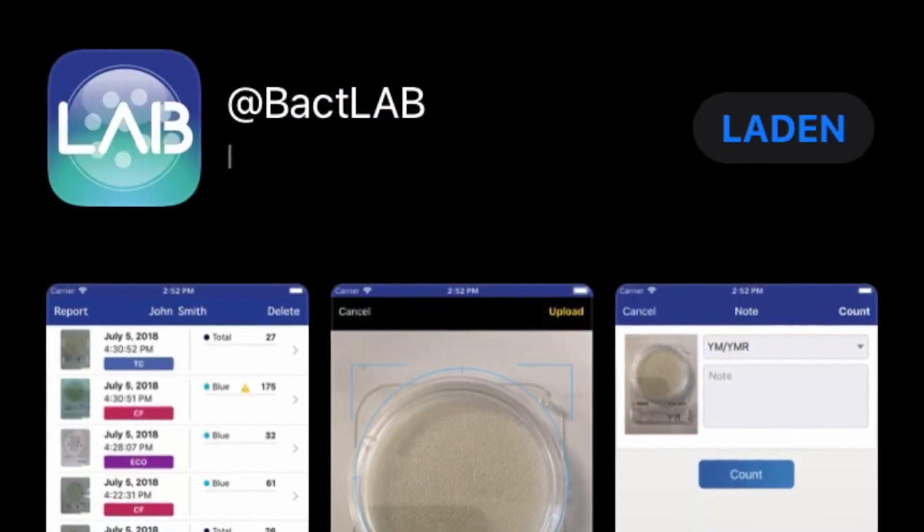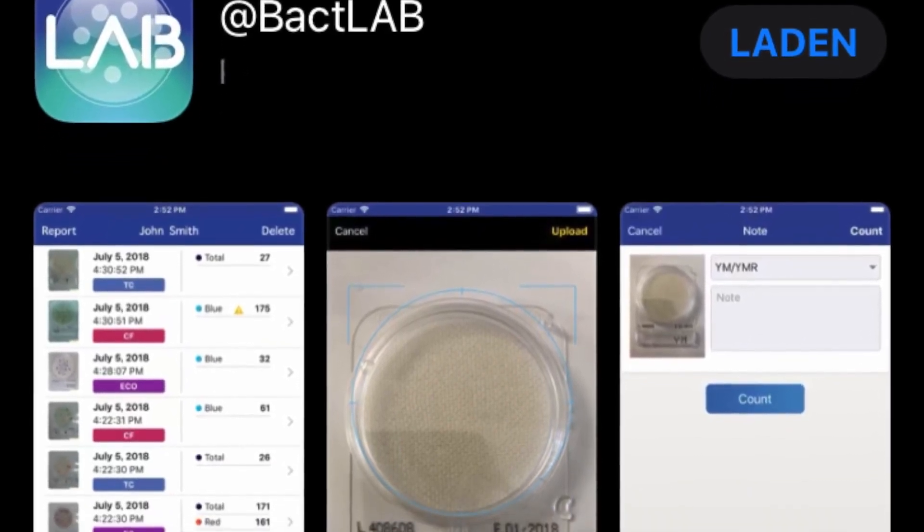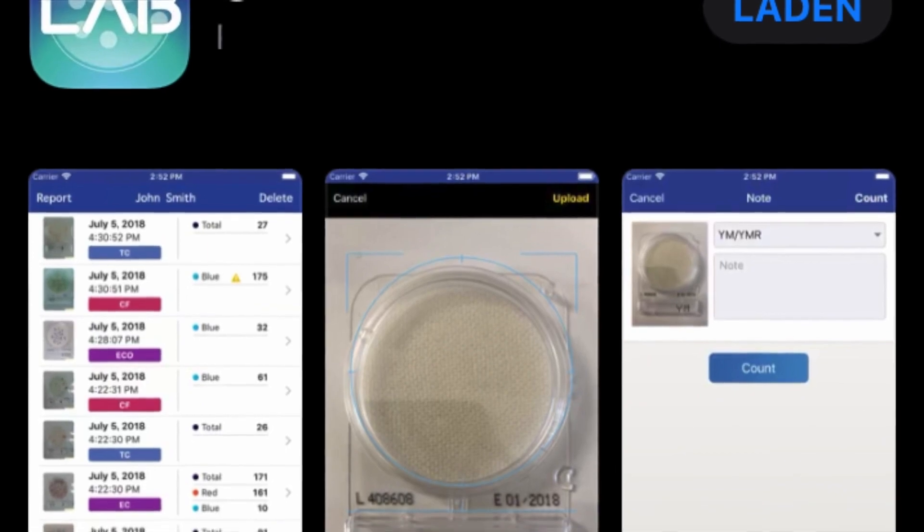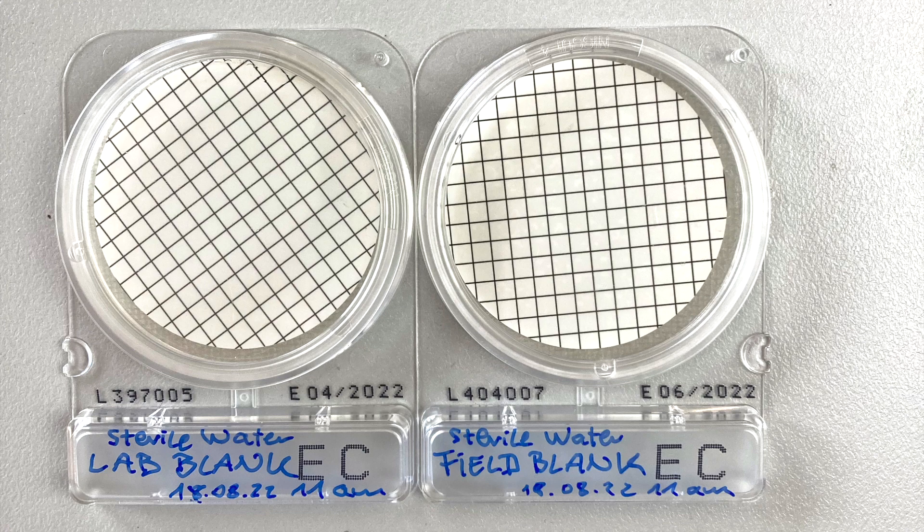With the BACTLAB application, you have the option to count the plates automatically using your mobile phone camera. Remember that your field and laboratory control blanks should give zero.